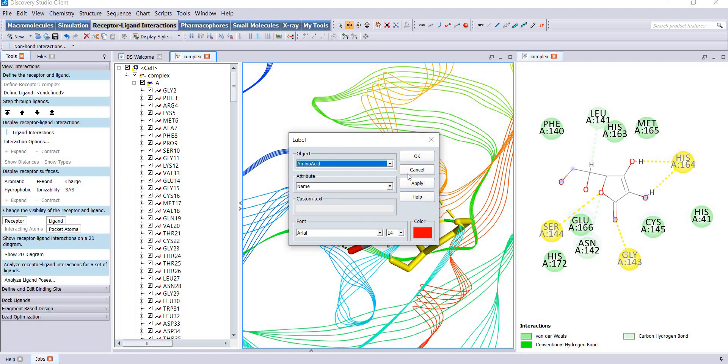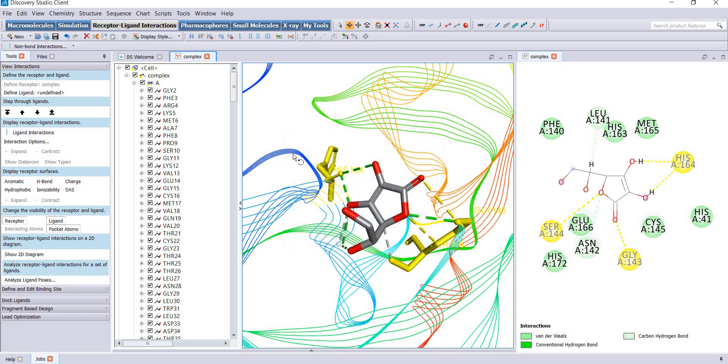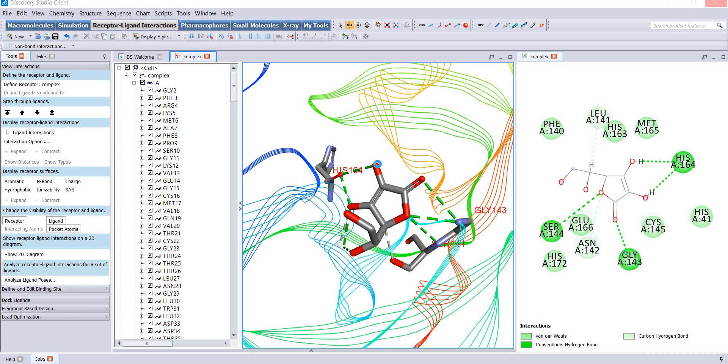Change the size and color, apply, and okay. Now you can see your amino acids are actually labeled.